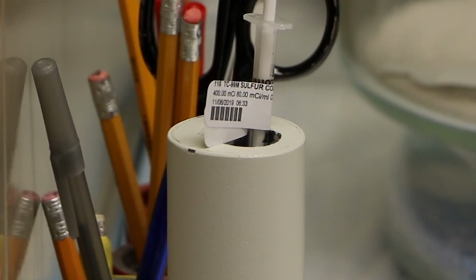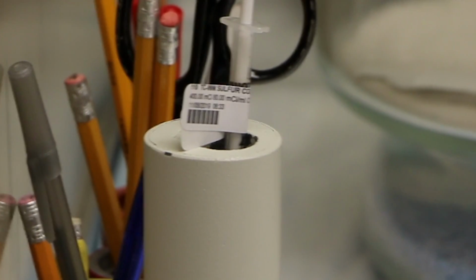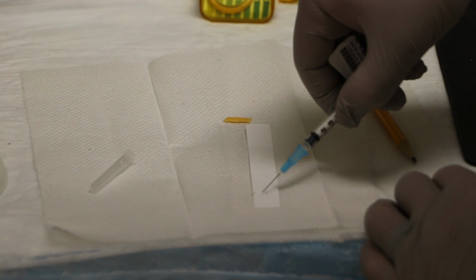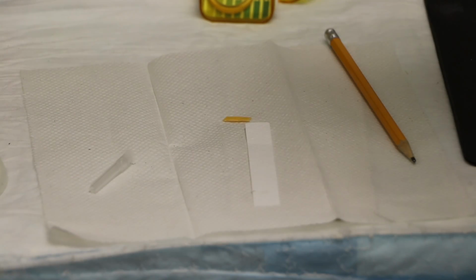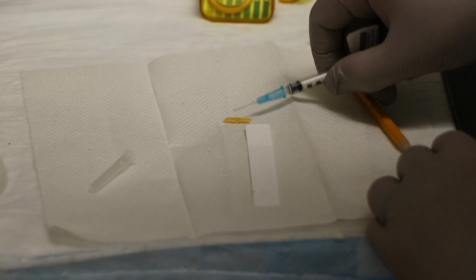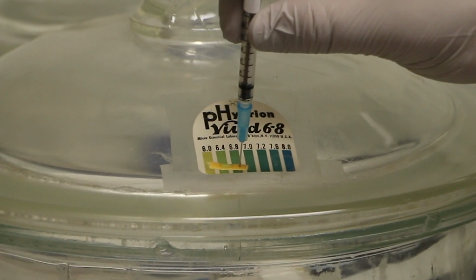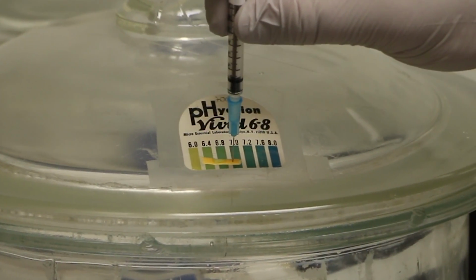Testing for sulfur colloid labeling efficiency requires thin layer chromatography as well as pH testing. Place 1 drop of the solution on the chromatography paper and 1 drop on the pH test paper. As sulfur colloid is very concentrated, the smaller the drop placed, the better. Hold the pH test paper in front of the pH color chart and ensure that the color is in the range expressed on the chart.